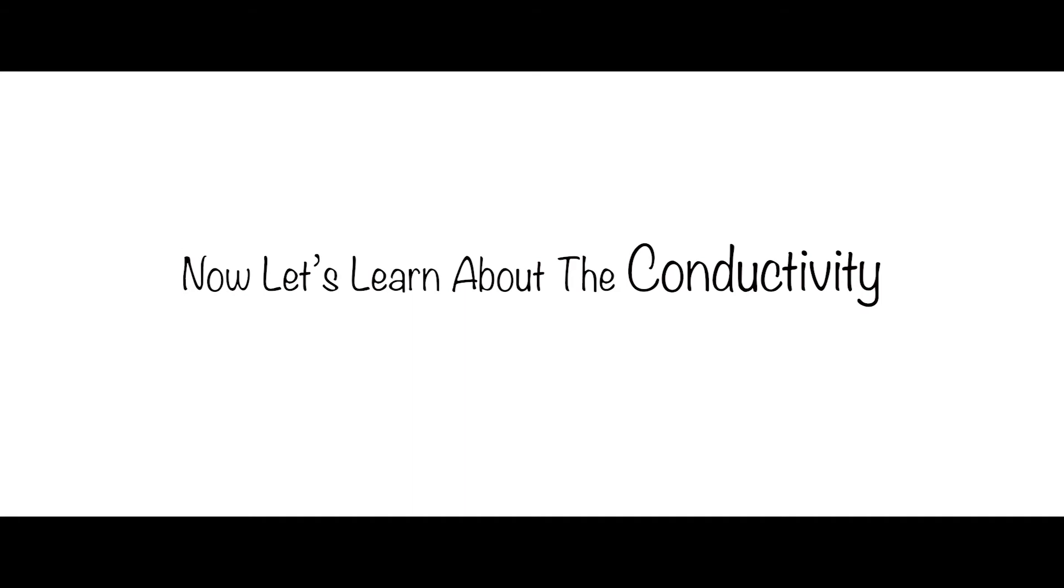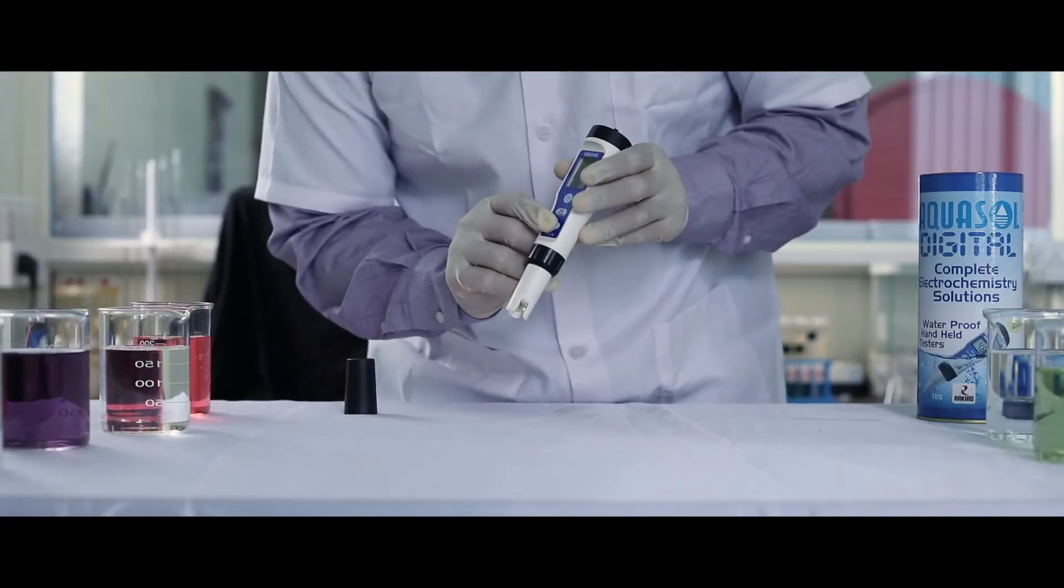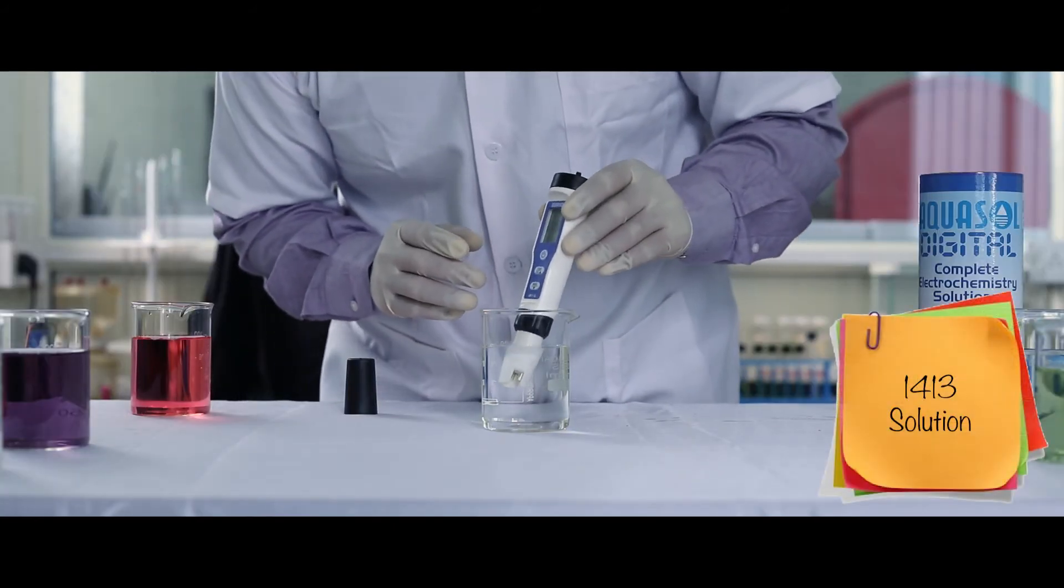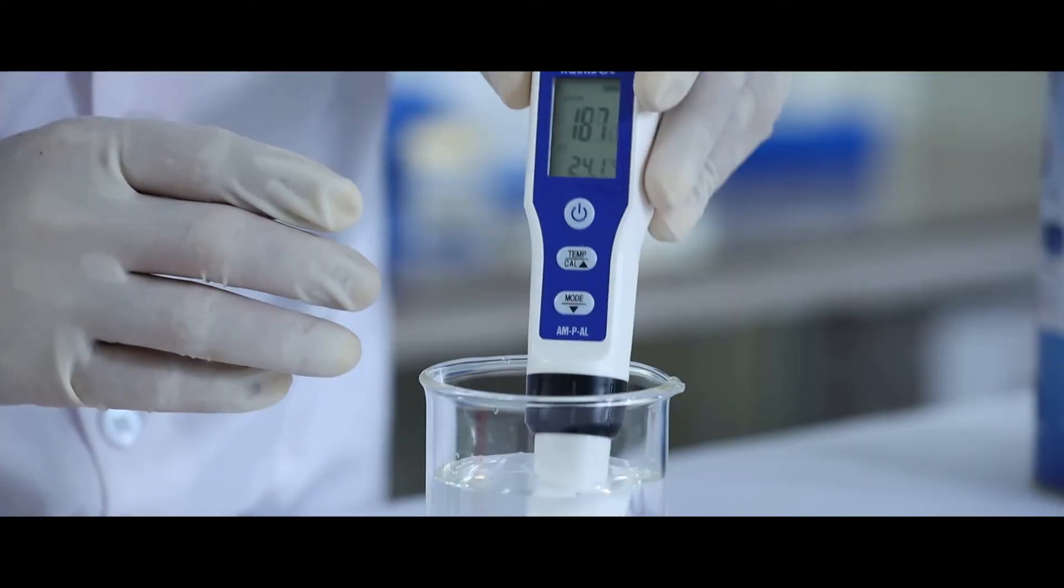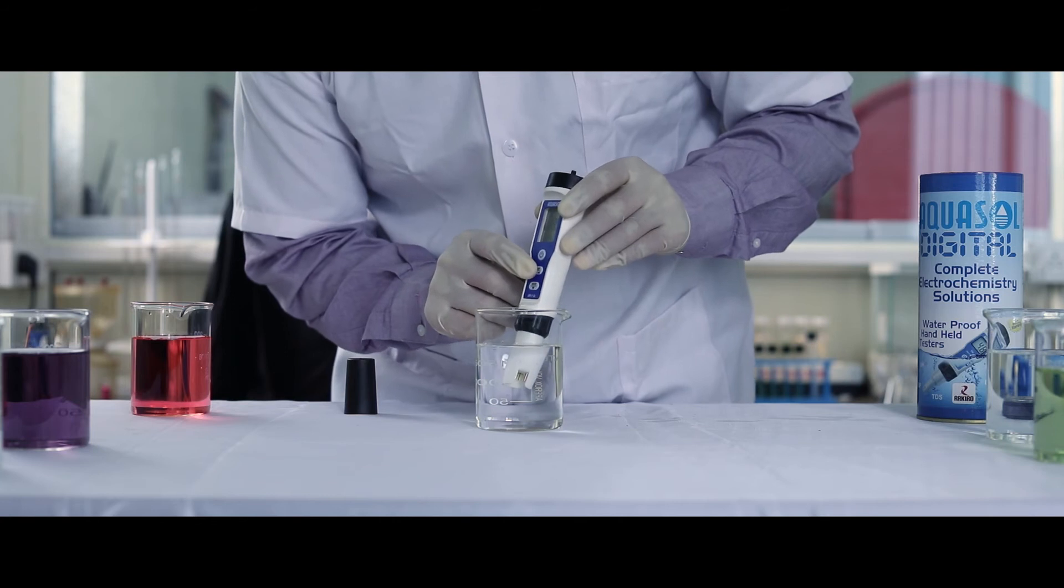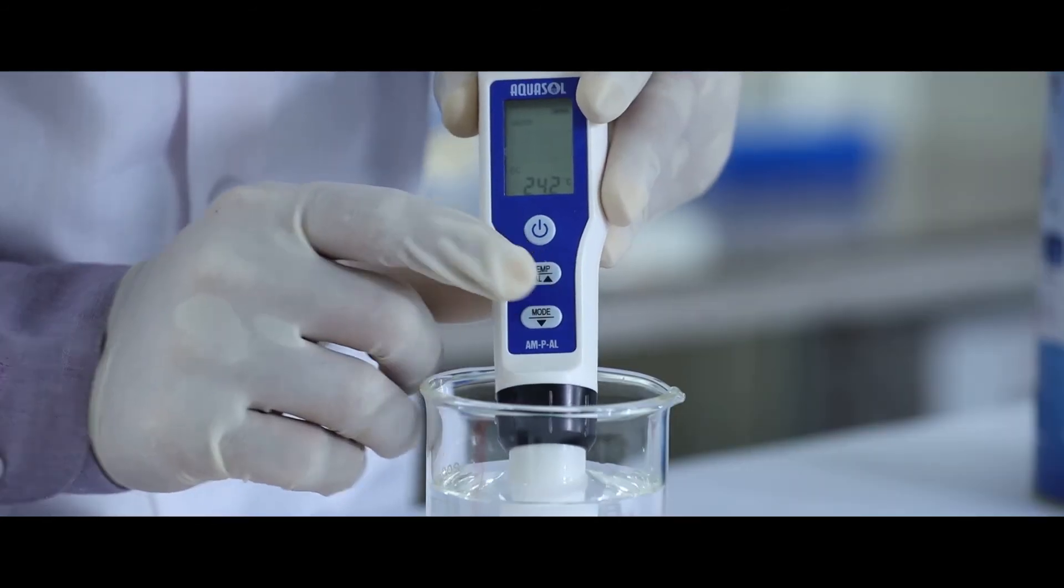Conductivity. Press mode to enter conductivity. Calibration. Dip the electrode in 1413 standard solution. Stir gently for stable reading. Press cal key to calibrate.